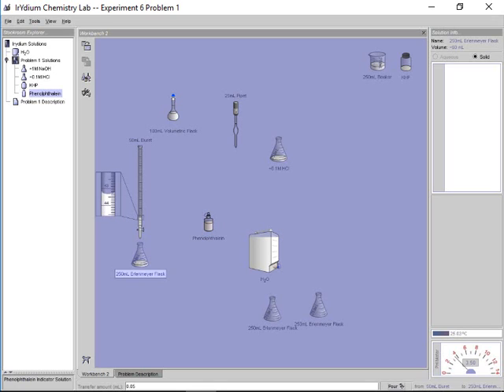Keep pouring it in. Oh, there we go. So again, I overshot by 1 drop. But again, the first trial is usually a waste anyways. In this case here, I'm going to take down the reading.